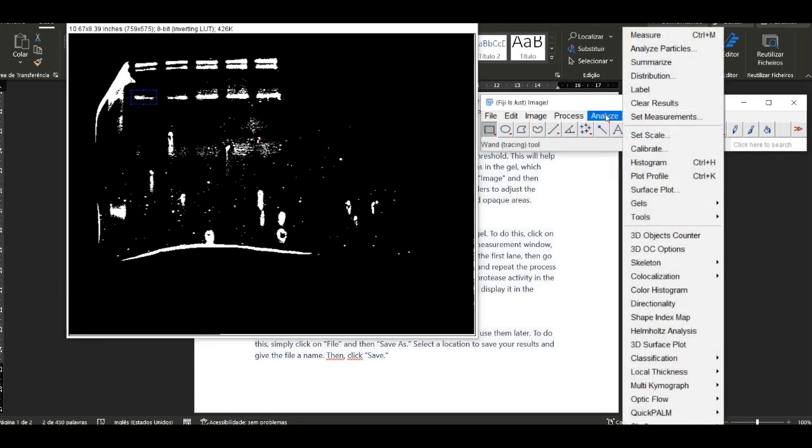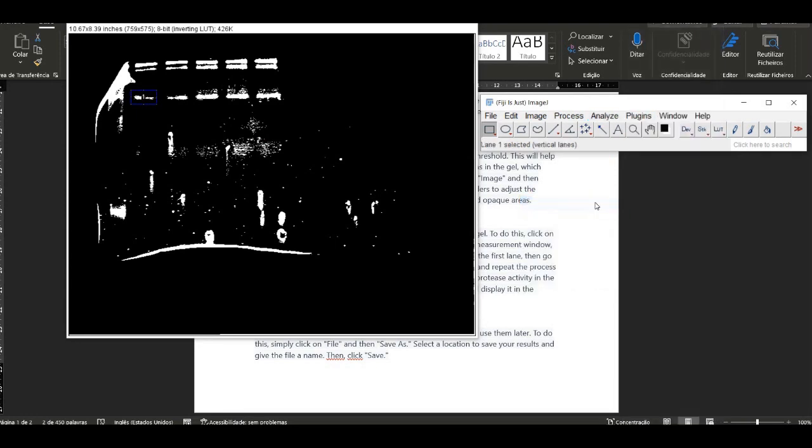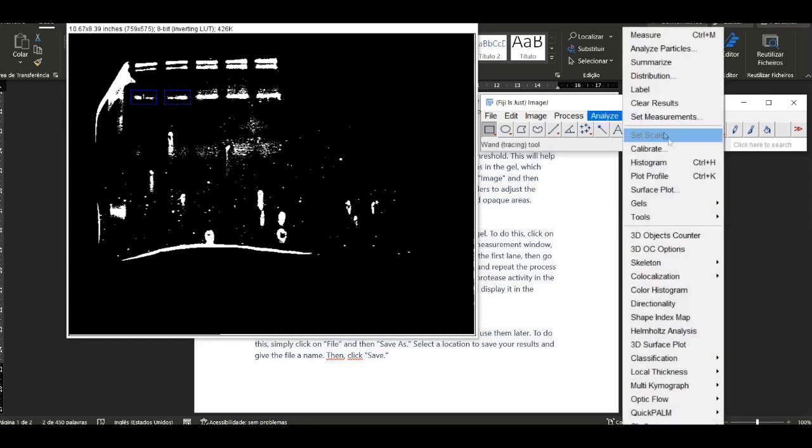To adjust the threshold, click on Image and then Adjust Threshold. In the Threshold window, you can use the sliders to adjust the threshold until you have a clear separation between the clear and opaque areas.